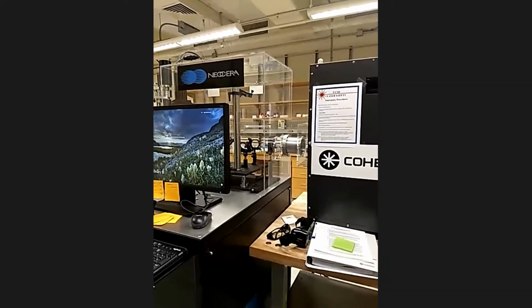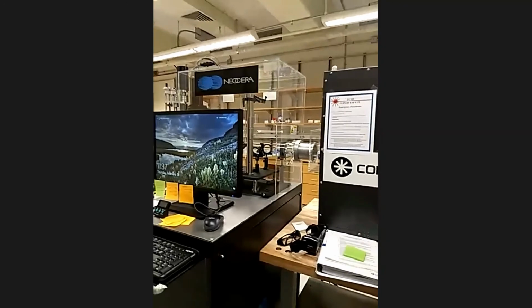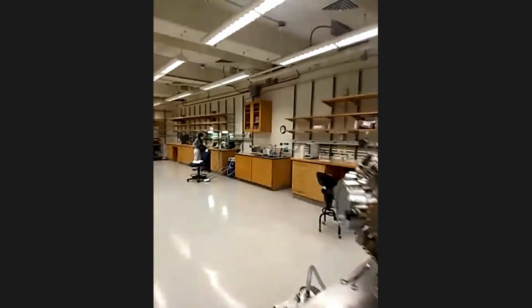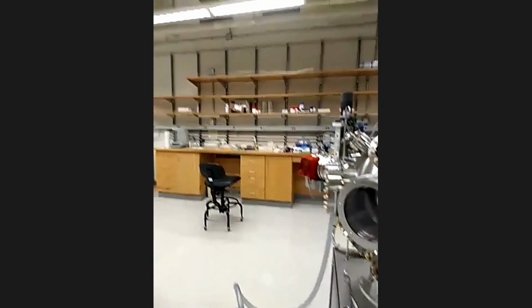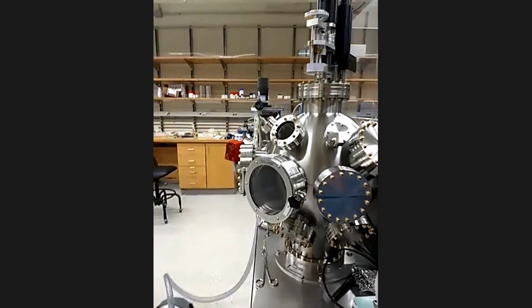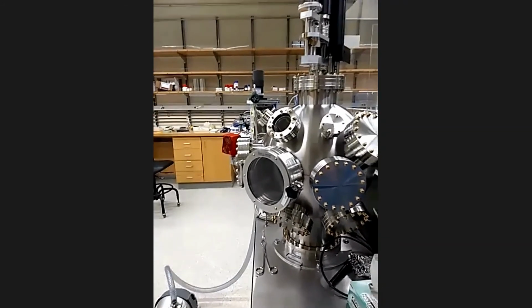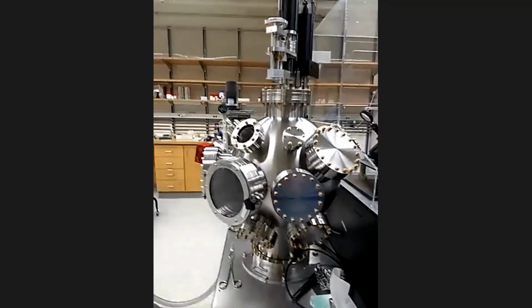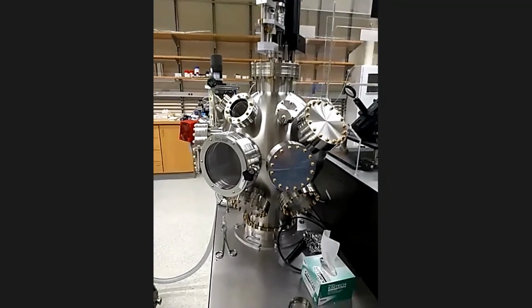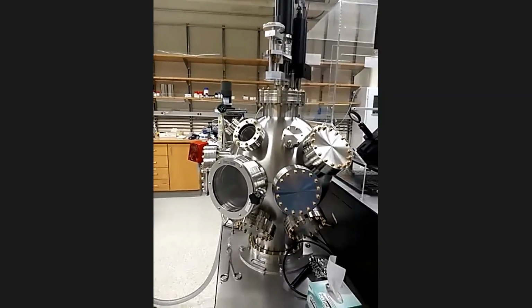But we are creating chunks of the material. We are using a stoichiometric reaction, pressing it, and creating the pellets. Inside the pellets, it's already the PrNiO3 material. Say, for example, we are creating thin films of PrNiO3. We have already created the material once we have done the solid state reaction, but we haven't placed the atoms in the exact symmetry we want.